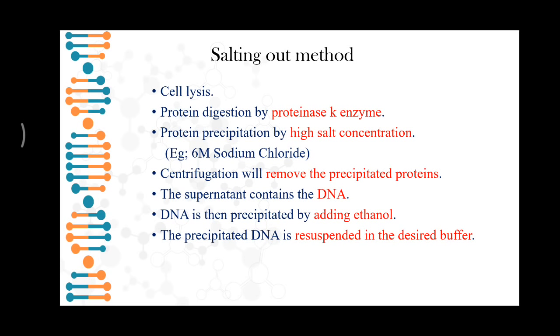The supernatant contains the DNA. The DNA is then precipitated by collecting the supernatant and adding ethanol. The obtained precipitated DNA is resuspended in the desired buffer.